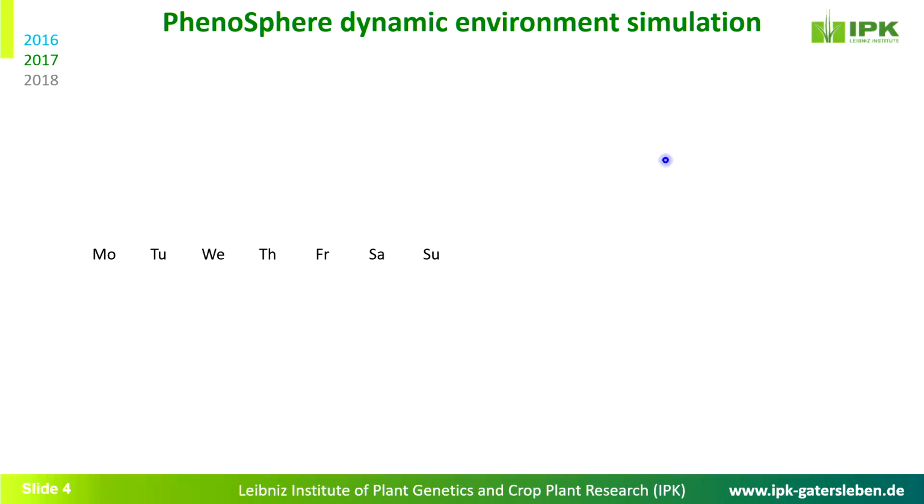So now I'd like to show you how we designed the climate simulation. For these experiments, I'm going to show you we run two experiments in the PhenoSphere, and the first we call average climate, and the second we try to do a single season simulation.